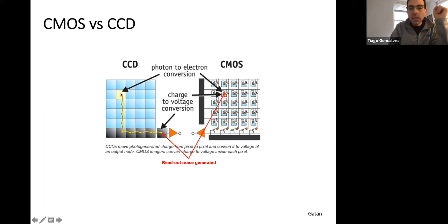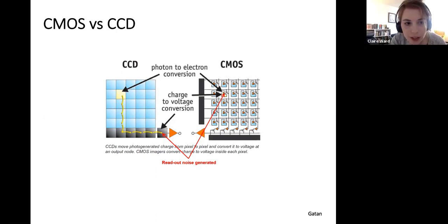Whereas in a CCD, you basically move charge around to one or two readout ports, where you move the charge between pixels, and then effectively you amplify it, read it out and digitize it out of a single readout space. Now, what is the problem? Can you guys think of what could be the problem with one and the other approach? Can you saturate one but not the other?